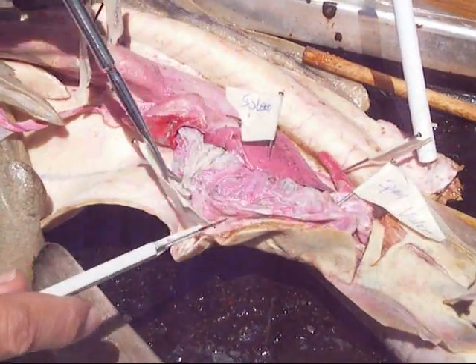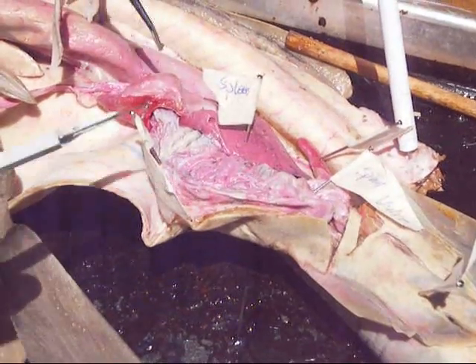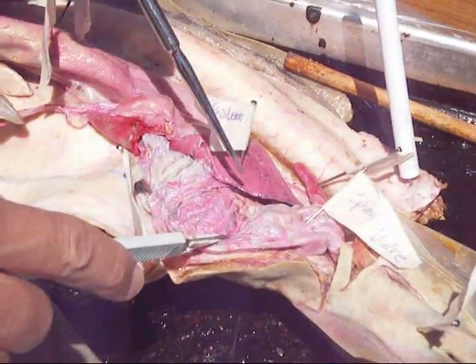If we cut it, would it be like small intestine-y, or is it just... Yeah, if you cut it, you'd be like a spiral staircase up in there. It looks a lot more like a spiral when the shark is fresh, and there's a small intestine.